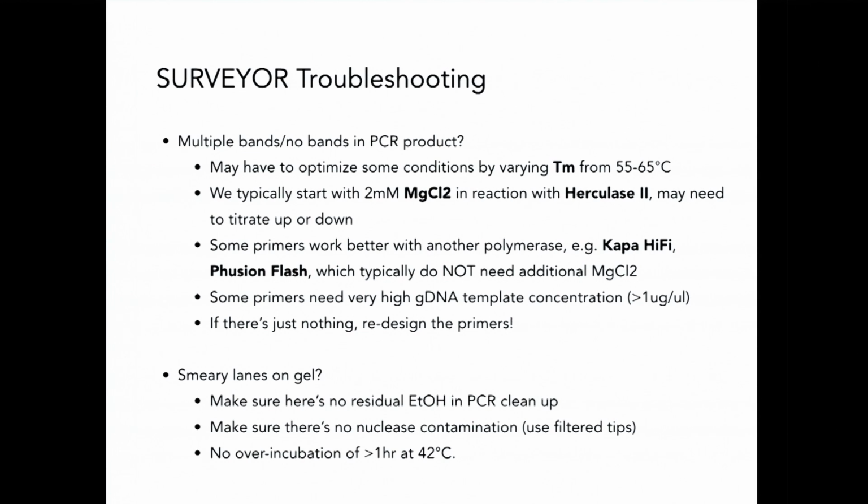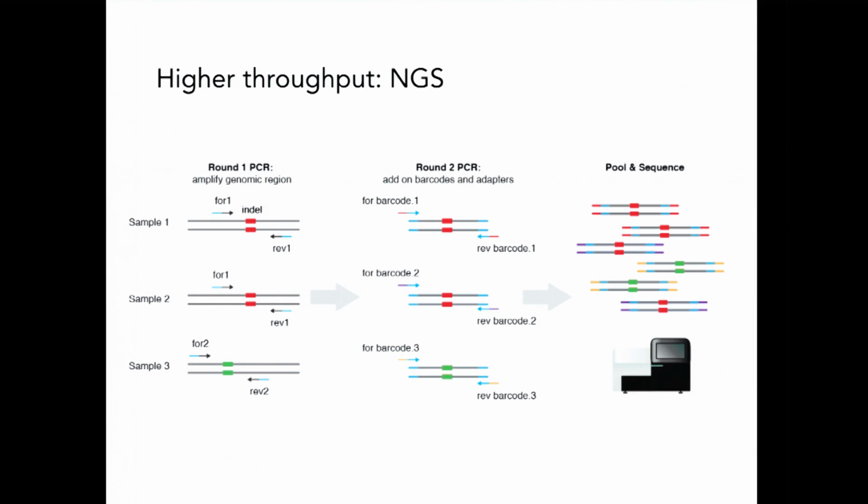And so if you leave this over time, if you're out for a while, if you over incubate, this can lead to smeary results that aren't good, and it'll be difficult to quantify.